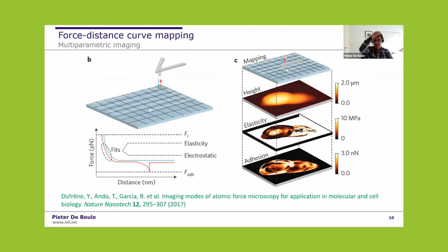And now, because I'm under a little bit of the assumption that the audience today might not be so familiar with the latest advances in bio-AFM, I wanted to explain in the next few slides what bio-AFM has to offer for biological systems. Most of you might know that you use an atomic force microscope for making topography images in the nanoscale regime of any object you can find.